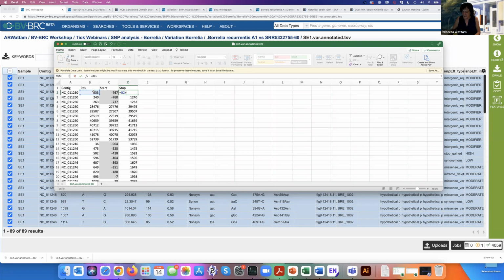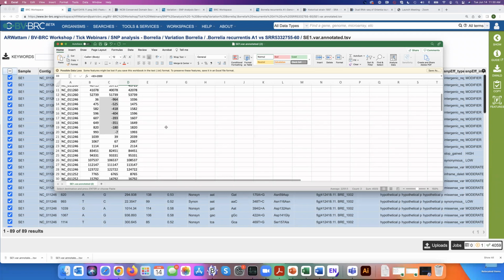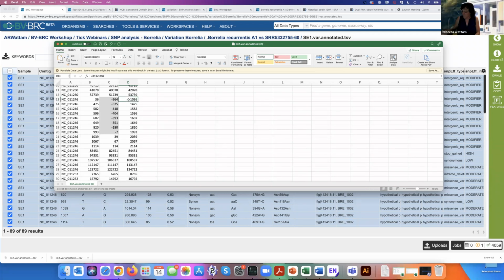So in this case, I'm just going to add the 2,000 to the start. Sorry, I know this is tedious. And another question from Lisa is, why did you use plus minus 1000 again? It'll be crystal clear in a second.